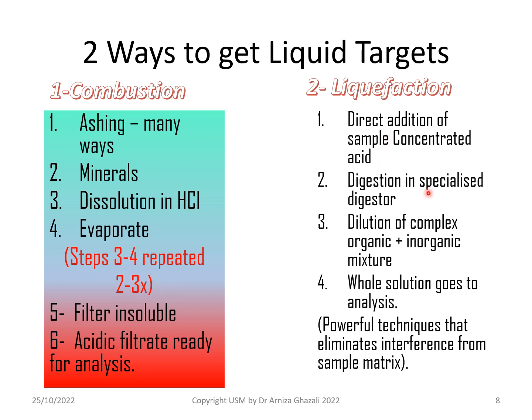Another way is liquefaction. If we have a specific digestion unit, we add acid to the sample, to the cockles for instance, let it dissolve in concentrated acid, we call it digestion, and then dilute the sample, and then it's ready for analysis. Certain machines, certain instruments can handle highly acidic acid like this.